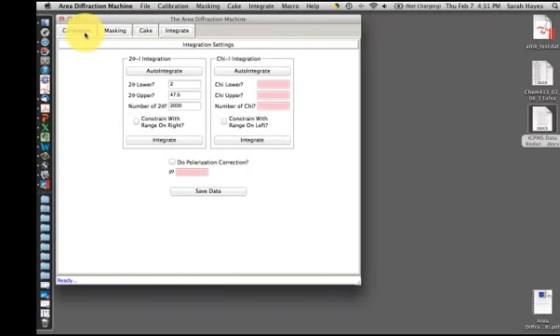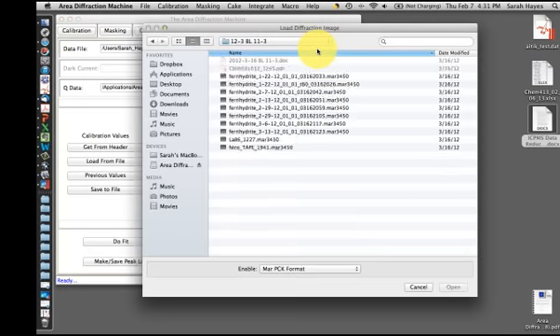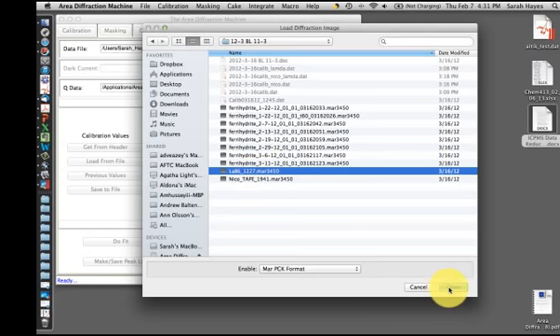The first thing that you're going to do is a calibration. So you want to open your data by clicking on the little folder icon, and then you will want to open Lab 6 or Quartz or whatever it is that you are going to use to calibrate your data. So open the pattern, and you can see here it shows what the program is doing, because some of these files are very large and sometimes it takes a couple seconds for it to open.